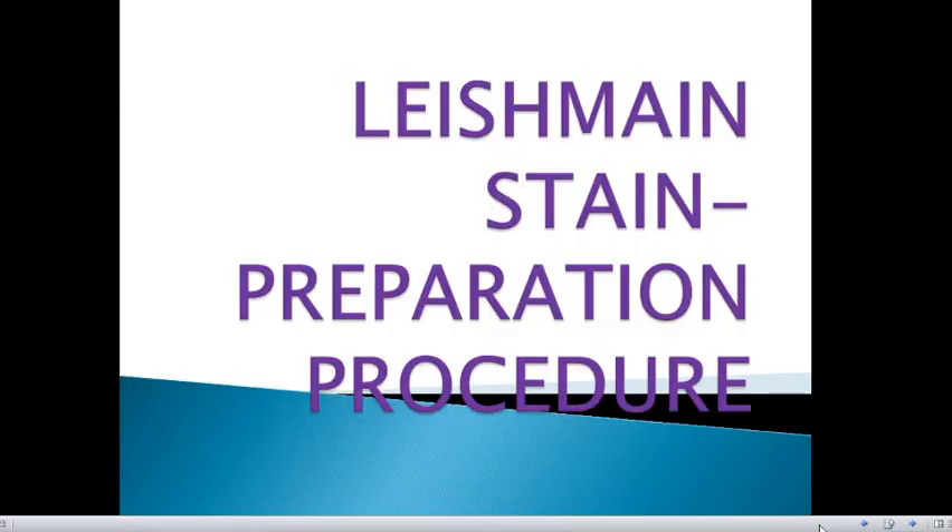In this practical video, we will discuss Leishman stain and the procedure for preparing this staining solution. Leishman stain is mostly used as a hematological stain. The principle and procedure for staining will be covered in a different video. For this video, we will be discussing how to prepare this solution.